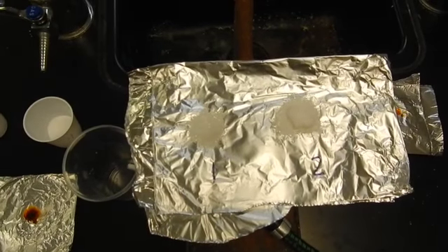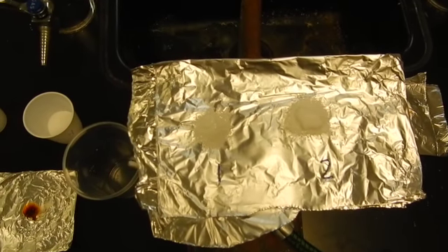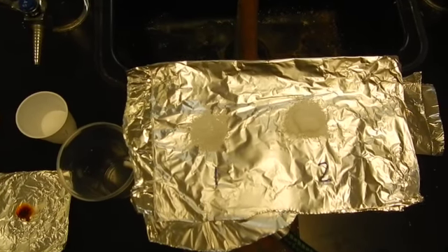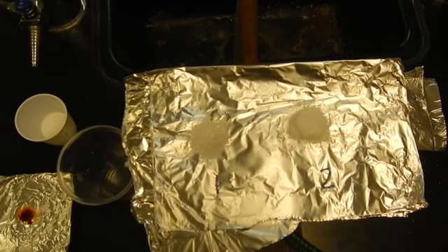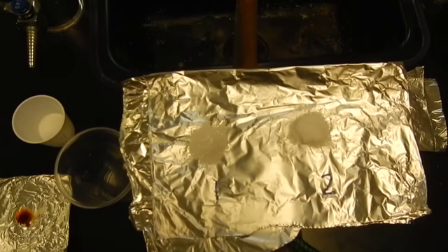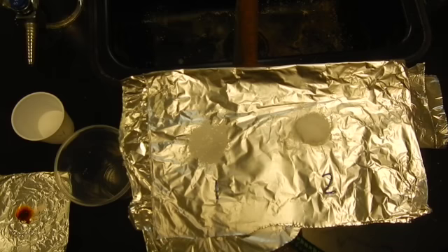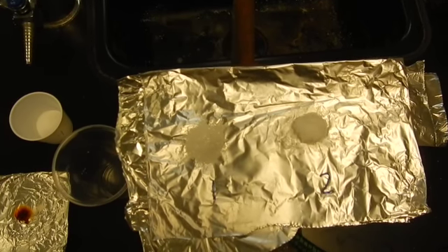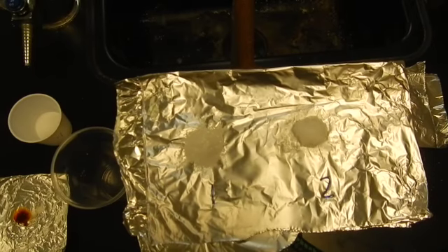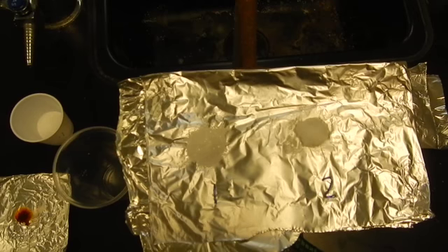You notice number 2 is already starting to sweat around the edge and starting to bubble, whereas number 1, nothing's really happening. So using that information, for number 1, you could put relatively high or low, and number 2, put relatively high or low.